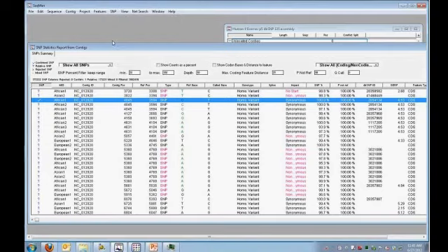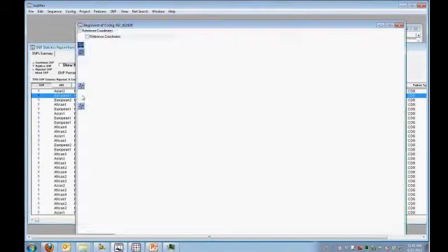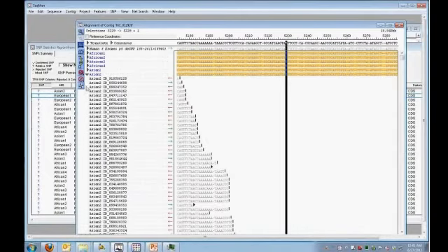What that's doing then is I might decide that I really want to look for novel SNPs. And so these aren't in dbSNP. There's no RS number here. And I might use SeqMan Engine then to, the assembly here, to go to my assembly.